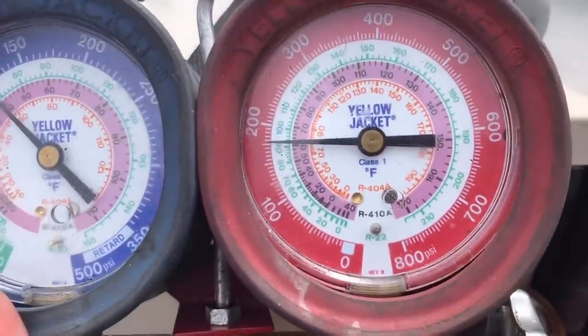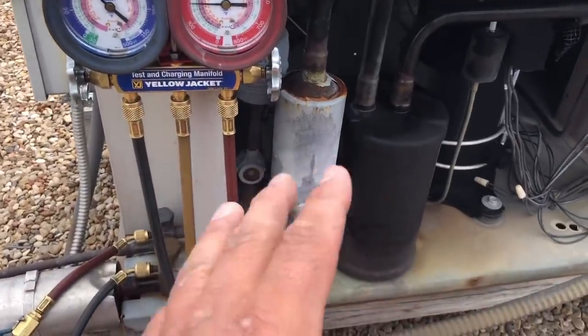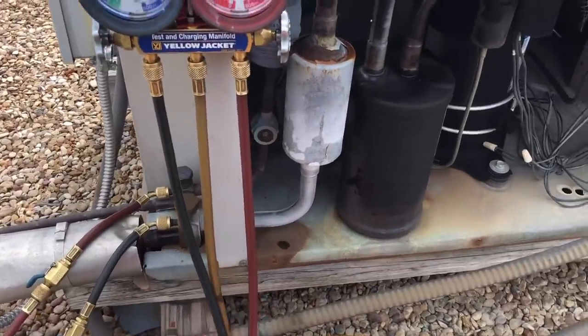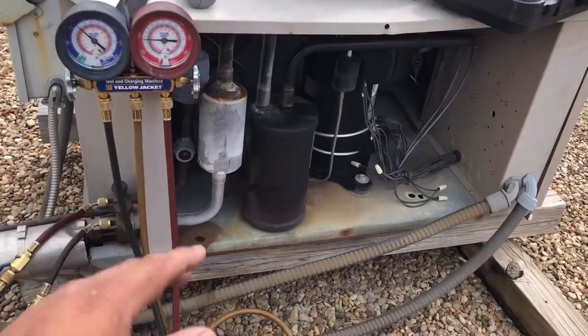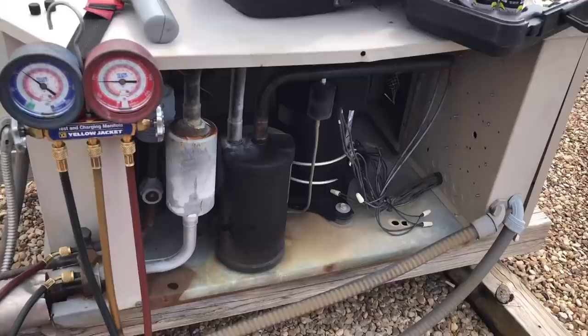The sight glass is looking a lot better. Head pressure is definitely looking a lot better. In a situation like this, if this freezer was completely flat, I would add a little bit of trace gas, put some nitrogen in it, and then do a leak search. But in this case it was just slightly low, so we're going to go ahead and gas it up, do a leak search, and figure out what's going on.